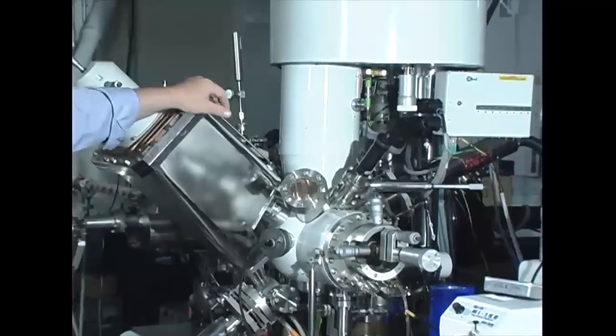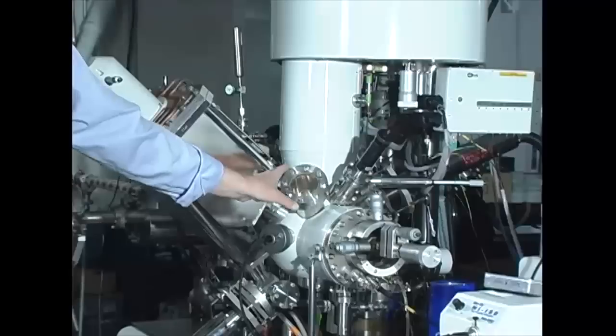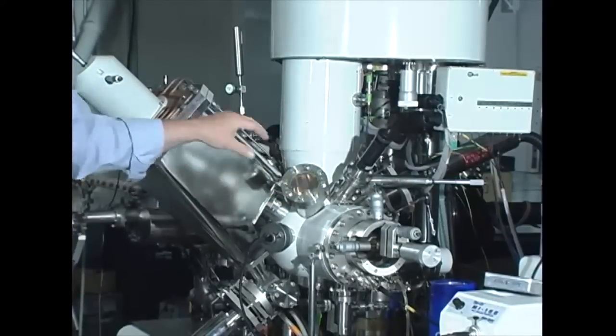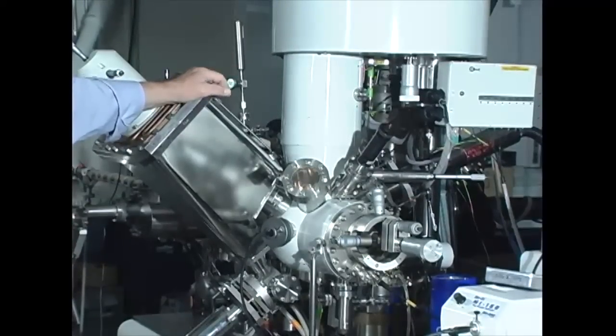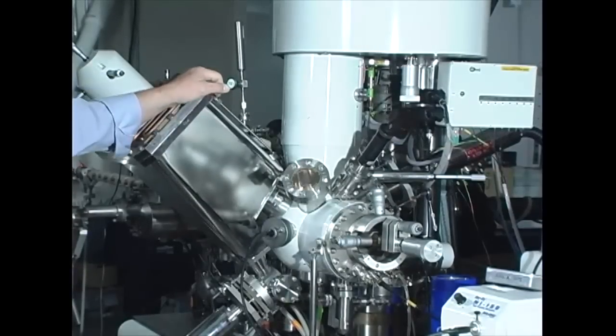So this makes this an extremely surface sensitive technique. It's one, therefore, that requires very high vacuums in order to maintain the cleanliness of the sample, but it also gives us elemental information and molecular information about the very regions of a sample that are important in both organic solar cells, organic light-emitting diodes, and organic field effect transistors.